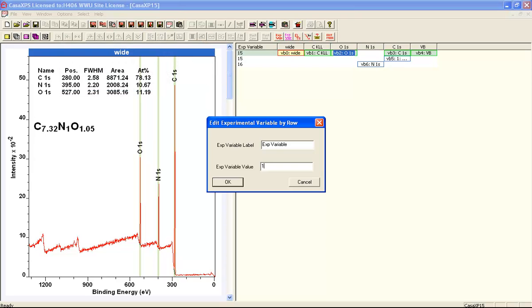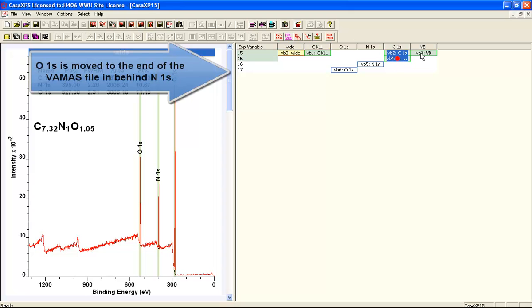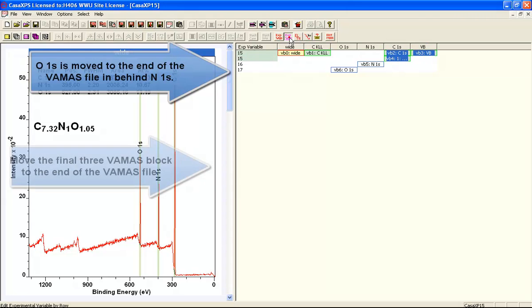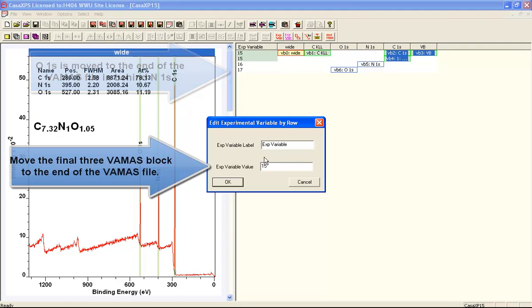By selecting the Nitrogen1S, we can move that to the end of the file by giving it a larger experimental variable than any other VAMAS block within the file. I've done that for the Nitrogen, I've just done it for the Oxygen.